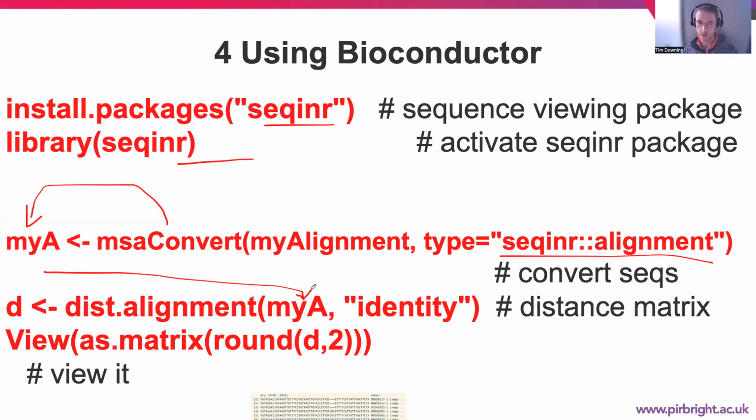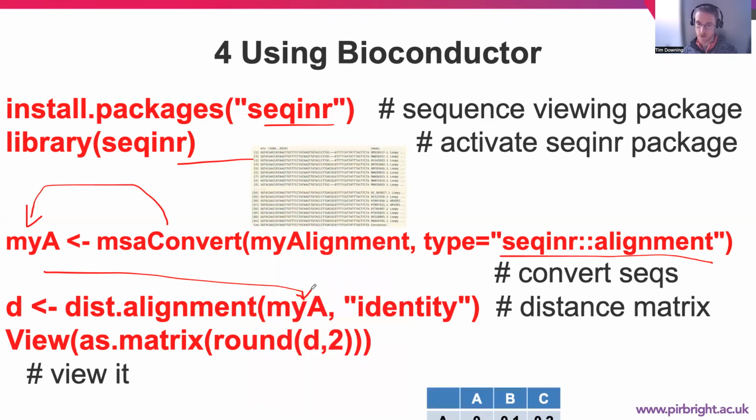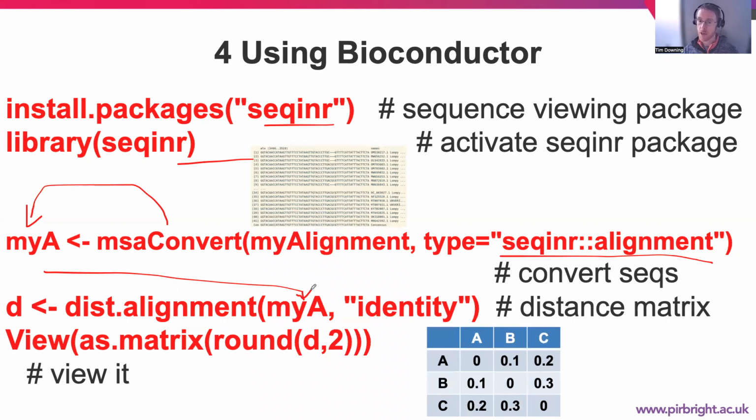So if you view our alignment to look something like this in our distance matrix, for each sample A, B, C here, for A versus A, obviously the distance is 0, the same for B versus B. But for A versus B, and likewise B versus A, you might find that there is some fraction of bases that are different. So typically these functions give a range of values between 0 and 1, where it simply denotes the fraction there. It may give the upper or lower diagonal only because this is symmetric.